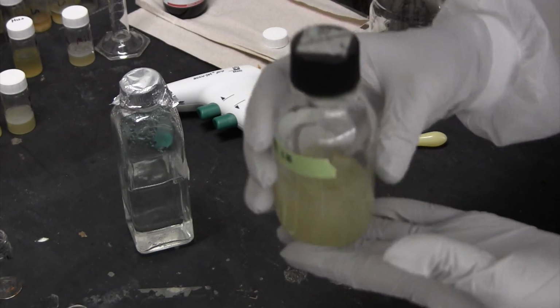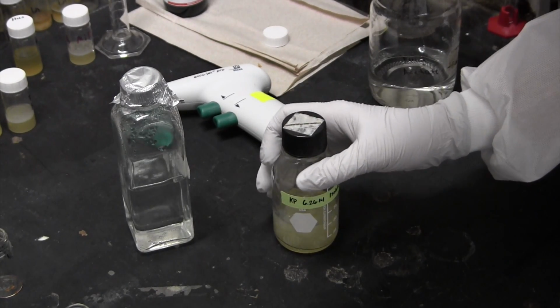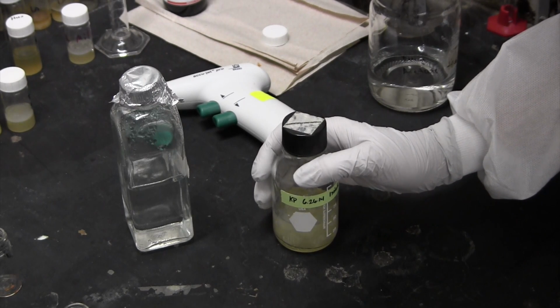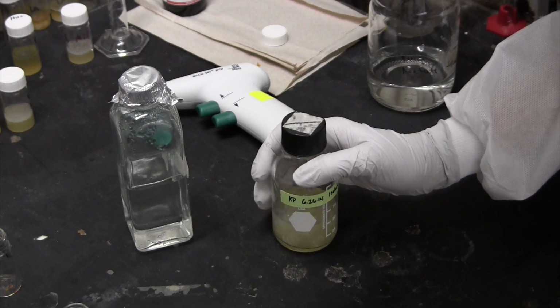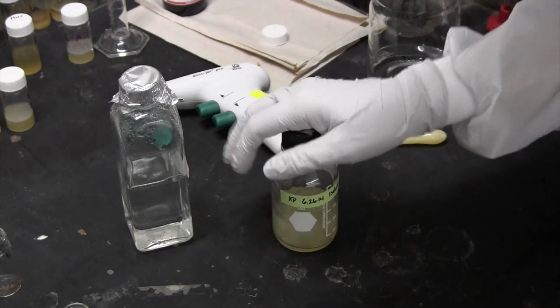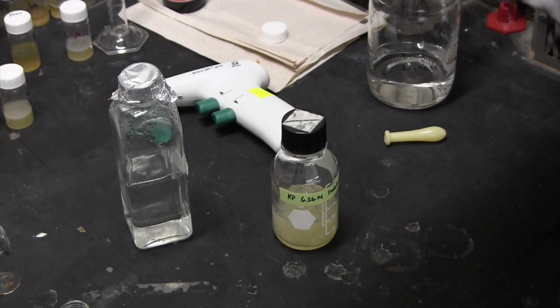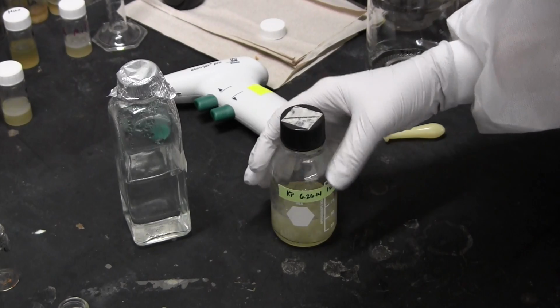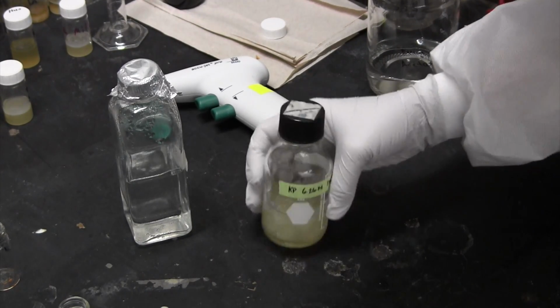And you can extract your agar for anywhere from 2 to 5 days. Less than that, you may not get a really effective extraction, although it's really going to vary. But when you start pushing it towards 5 to 7 days, if there is any activity, you might lose it. So most people will let it extract from a Tuesday to a Thursday or a Monday to a Wednesday, or from Thursday overnight until when they meet again the following week. So you can keep it shaking at room temperature that entire time until you meet with your students again.